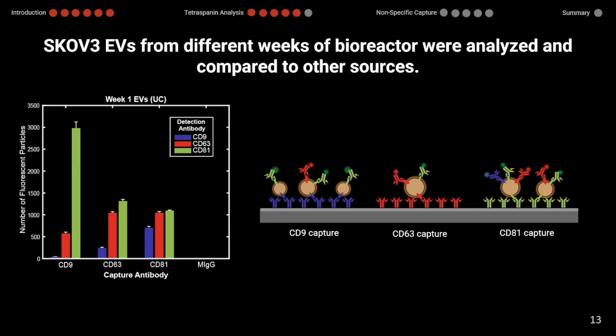I'm jumping on one of the comments or questions from Tiago Costa-Coelho. Do you think it's possible that there is some soluble form of tetraspanin that can be co-isolated with ultracentrifugation and actually compete for the binding site of the antibody? It's possible. But I don't think that that's at least what's happening here.